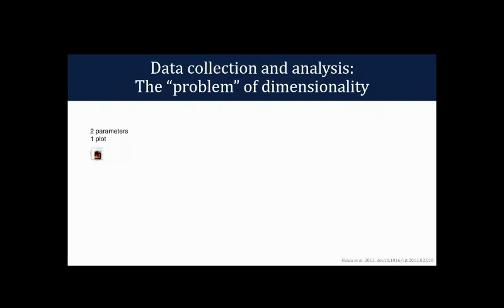That gets us to the really fun thing, and I think this is something that Gary Nolan at Stanford introduced as a really interesting problem, and I really love the way that he presented this issue. When you look at a regular two-parameter biaxial plot, it's really simple to make an inference about what you're looking at. The same is true even if you add 3 parameters. You get 3 plots. It's really easy to compare these even across samples.